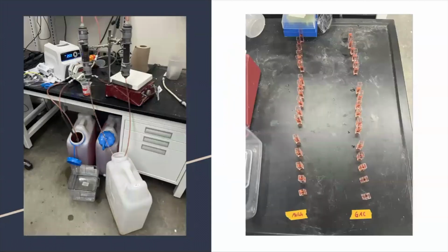For the column portion of the experiment, we used 2 columns for the respective groups, with the same diameter tubing, the same inlet, and the same setting for both groups. The sand utilized in the columns was also the same weight, coming out to be 89.0325 grams and 89.0524 grams. The columns were filled with the sand GAC mixture and the sand mulch mixture. We set the pump flow rate to 20 RPM and timed the flow rate ourselves, determining that the actual flow rate was 16 milliliters per minute.